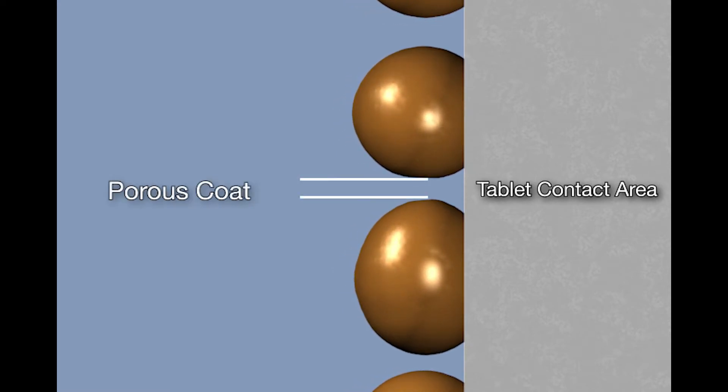If the evaporation rate is too high, the polymer chains have insufficient time to settle completely over the tablet contact area and will produce a porous coat.